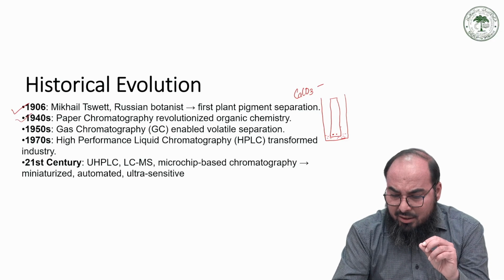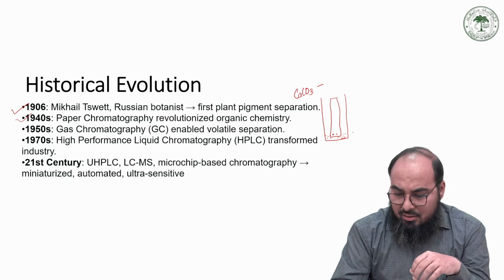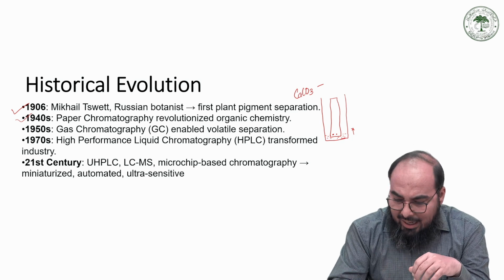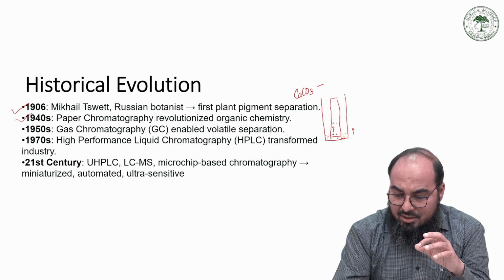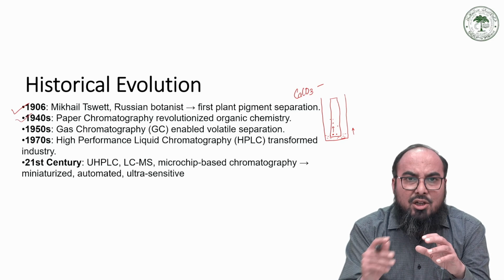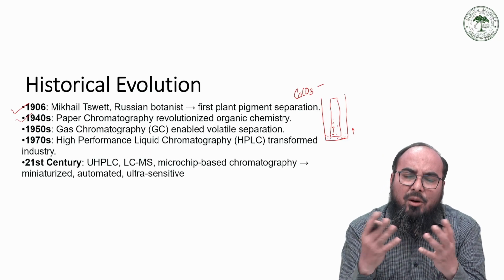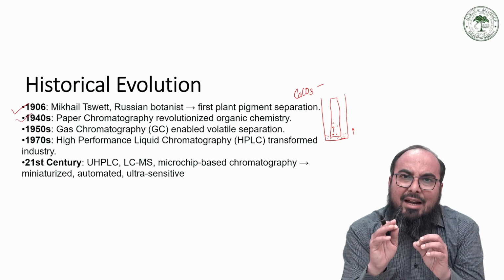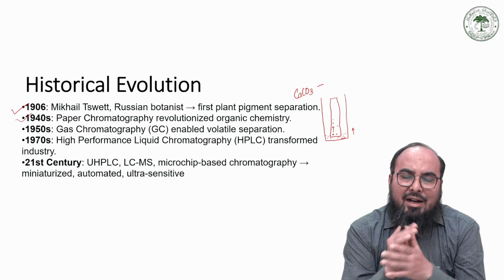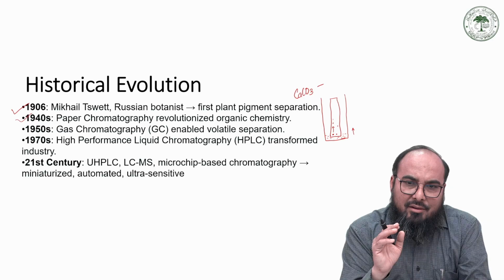They dip it a little bit, and then the solvent system rises, and this also rises. After a certain time they show different colors, and on the basis of color you identify that if there are three spots, then you can say that it's a three component system. Each component has a separate RF value, called the retention factor, and this RF value is characteristic for each component.